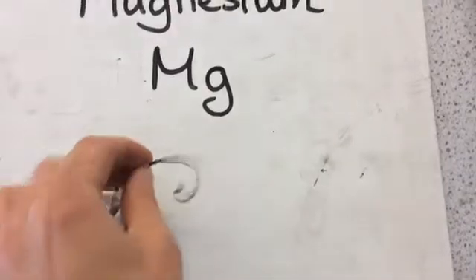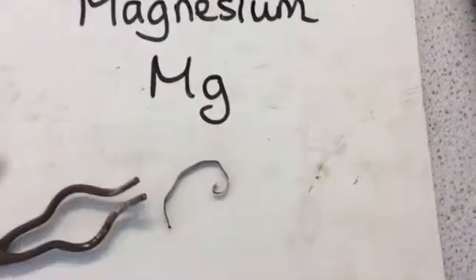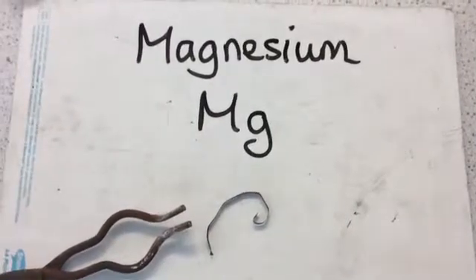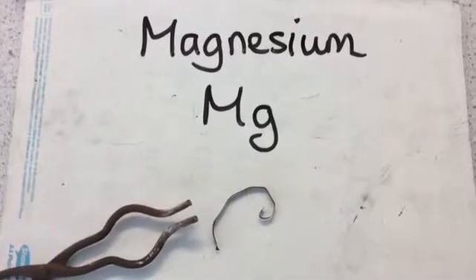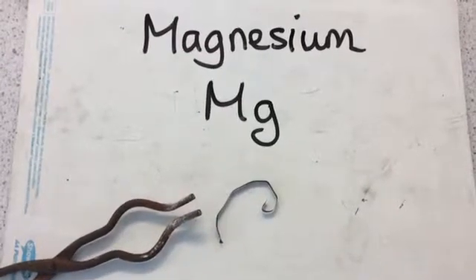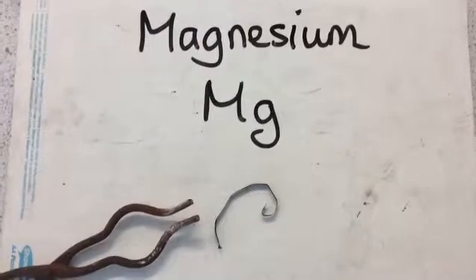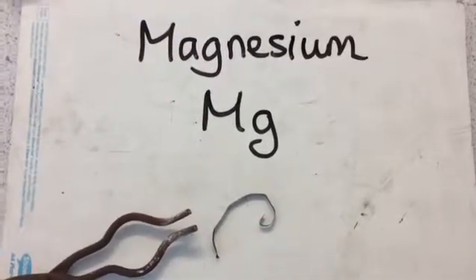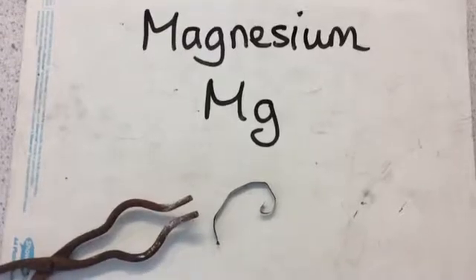You can see it's this kind of dark grey color and we're going to burn it and form the oxide, magnesium oxide. And then we're going to test out whether that magnesium oxide is an acid or an alkali. We're also going to be looking at what happens to the mass of the magnesium as we react it with oxygen to form the compound magnesium oxide.